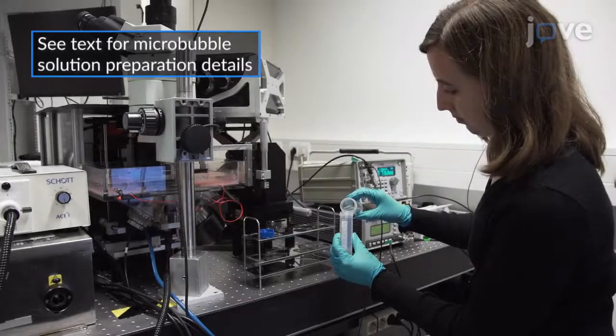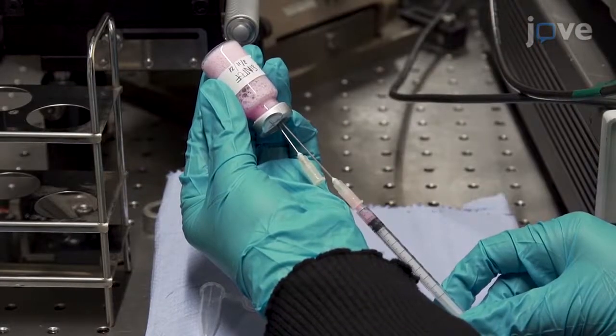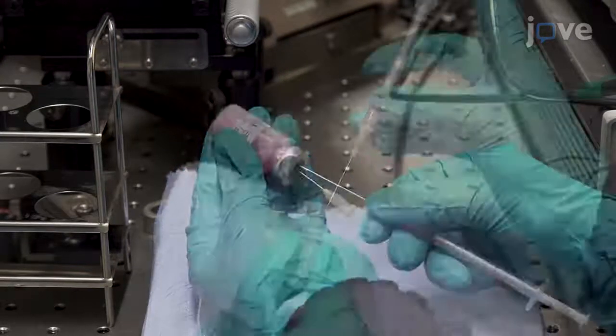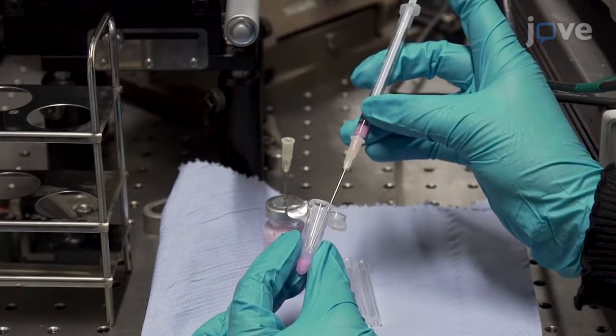For single-bubble imaging by Brightfield Microscopy, place a 19-gauge venting needle and use a 1-milliliter syringe equipped with a 19-gauge needle to remove a small amount of microbubble suspension from the glass vial into a small tube for easier pipetting.